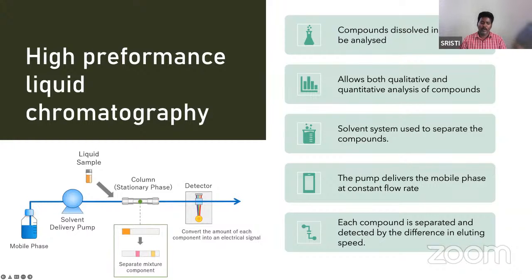Likewise, some molecules cannot be used in a single solvent system. In that case, you can use more than two solvents, or a gradient solvent system can be used. And the solvents are normally acidified a little, using trifluoroacetic acid or trichloroacetic acid, so that the elution rate will be better, and the peak values, the individual compounds' detection level, will be very good.